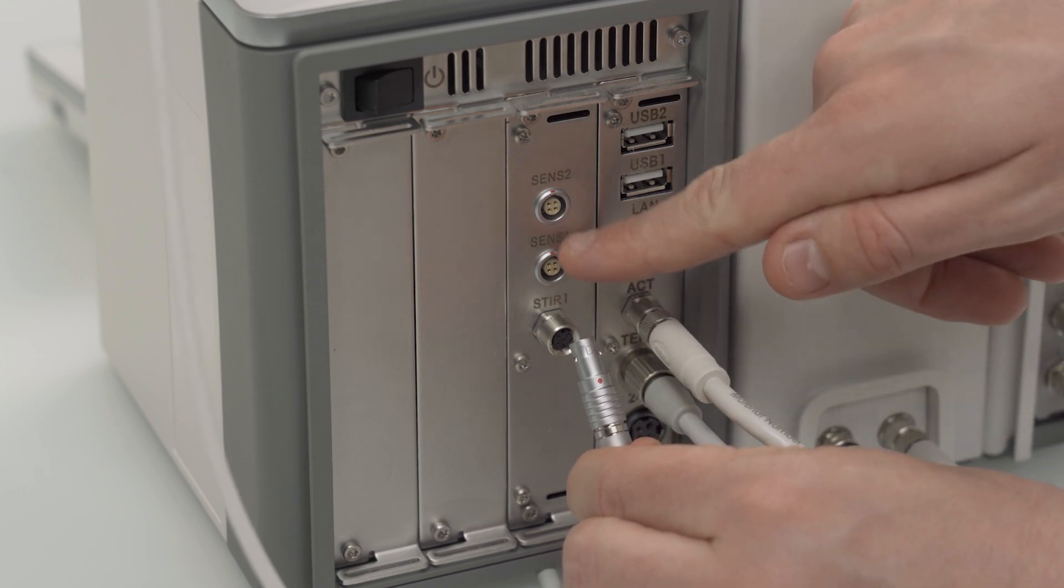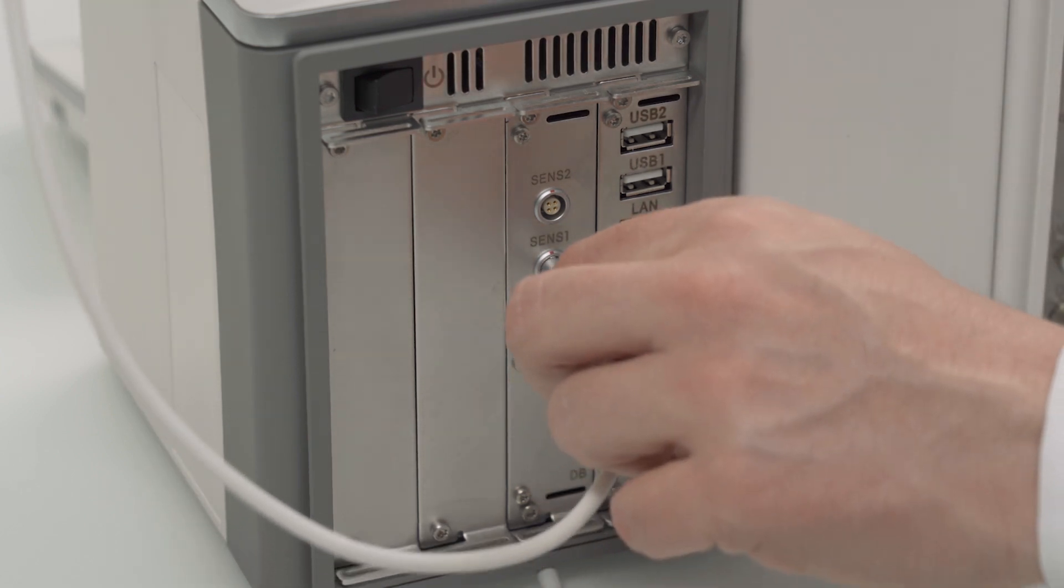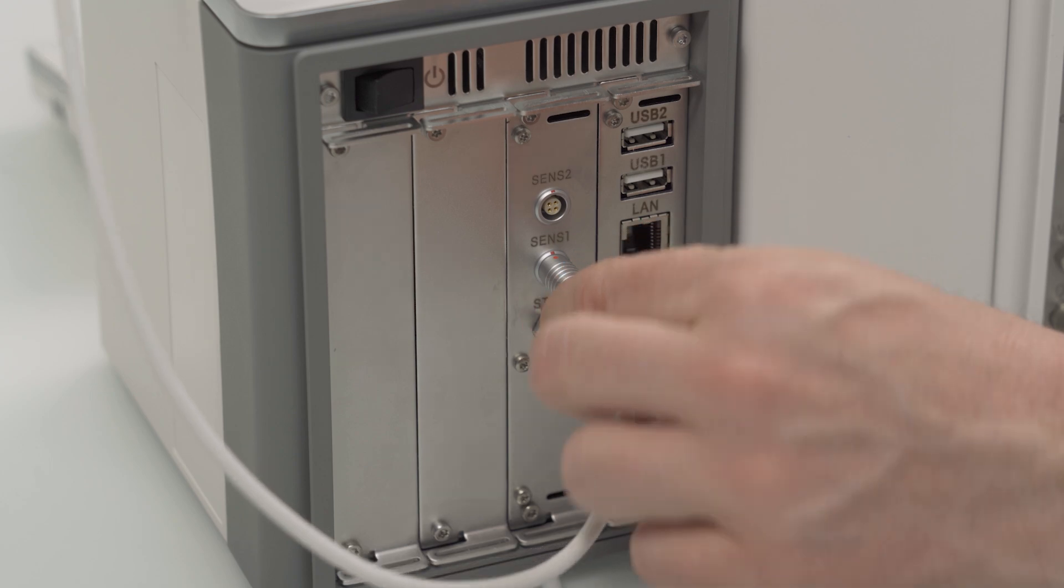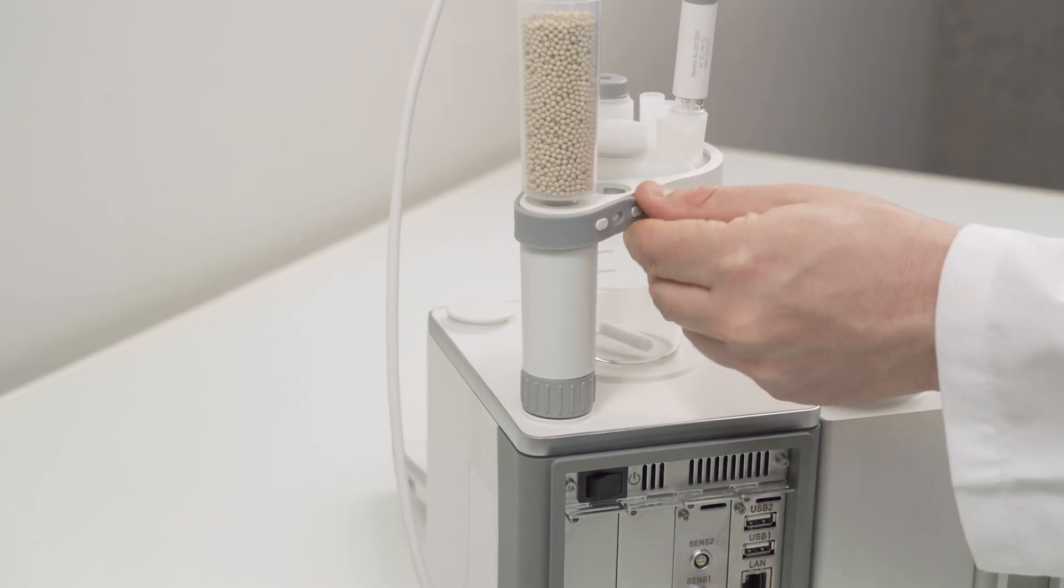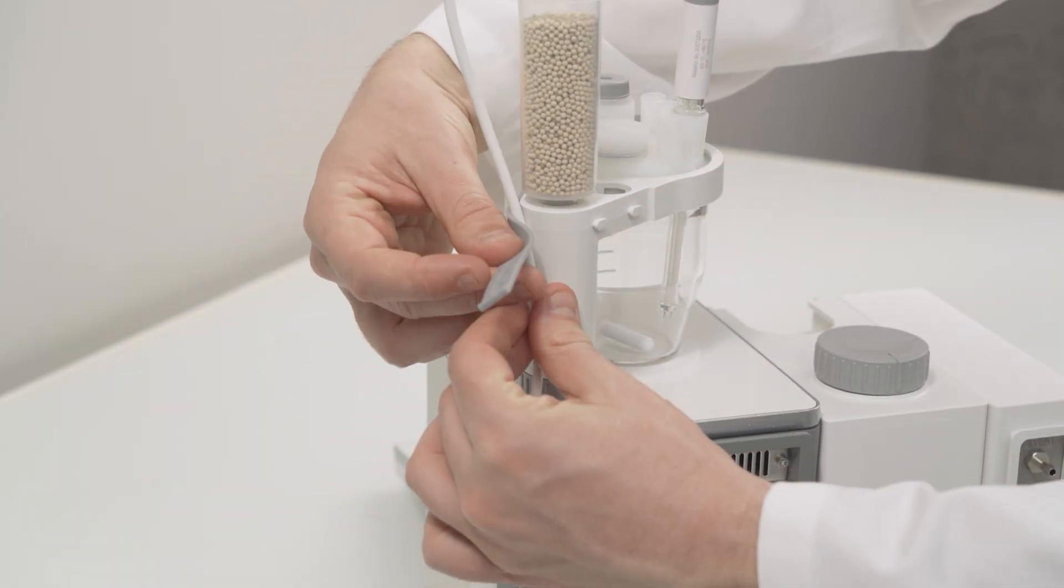Connect the other end of the sensor cable to one of the sensor sockets on the device board. Make sure to align the red dots before pushing it in. Then fix the cable to the titration arm with the rubber strap.